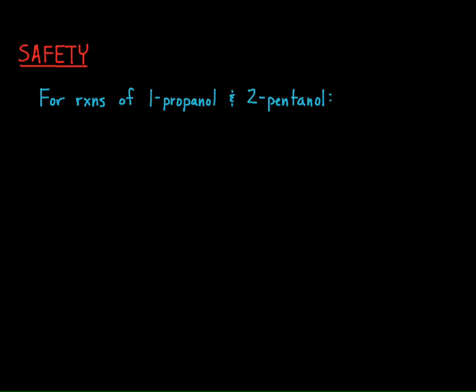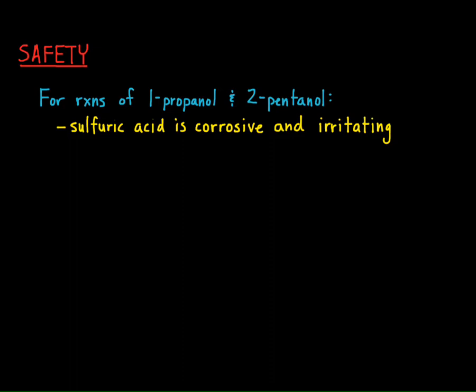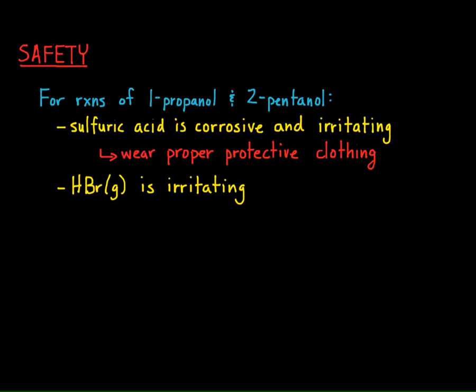For the reactions of 1-propanol and 2-pentanol, you will be reacting your assigned alcohol with sodium bromide in the presence of sulfuric acid. Sulfuric acid is corrosive and irritating. Because of this, you will want to protect your eyes, skin, and clothes. It also reacts with sodium bromide, producing hydrogen bromide gas, which is irritating as well. It is essential then that you cool your reaction mixture in an ice bath after completing the reflux time. You also want to avoid inhaling any vapors.